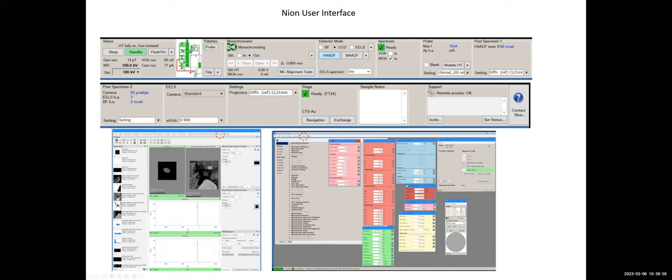So let's move on to another window, CL setting align. This window is used to align the condenser system. So we normally use this window when we use a condenser setting other than the 19 milliradian standard reference. So say if you go to 33 milliradians and then you want to align the condenser probe, you want to use this window. There is a concept here.